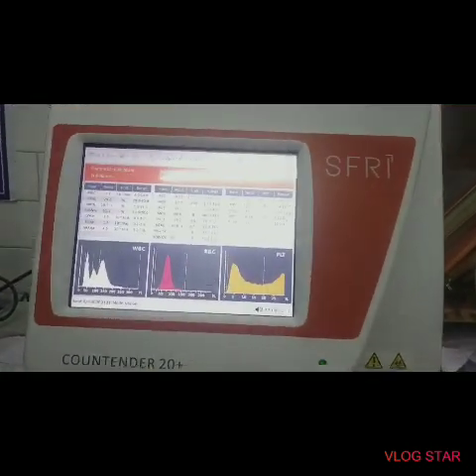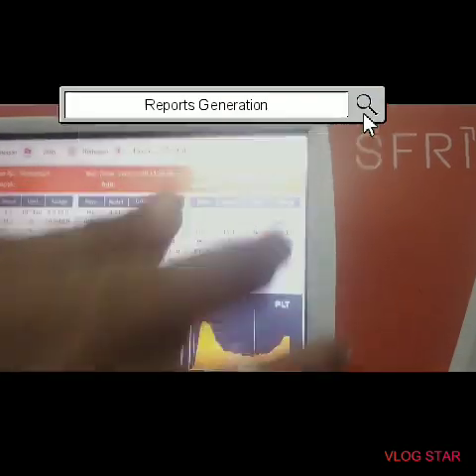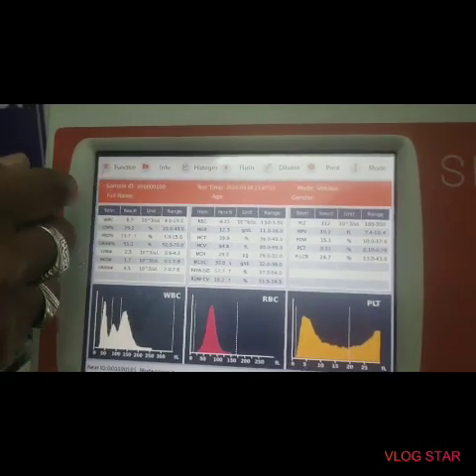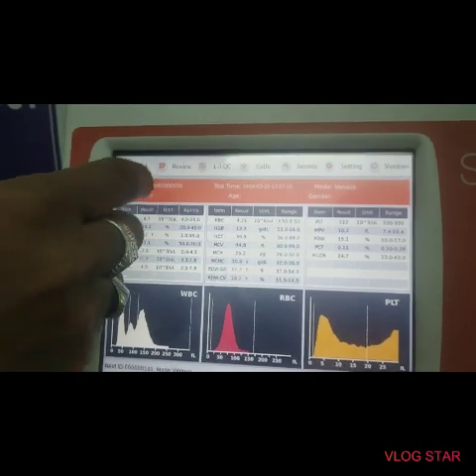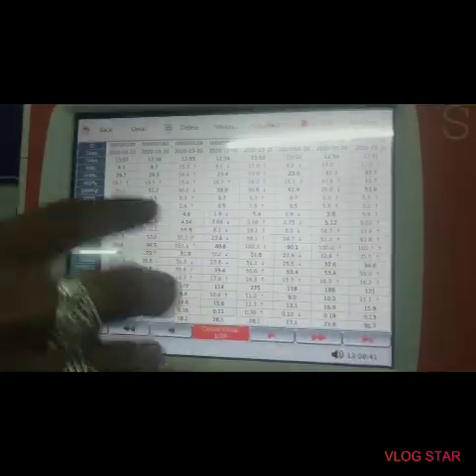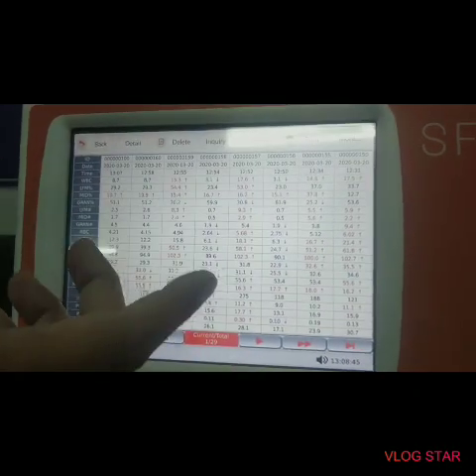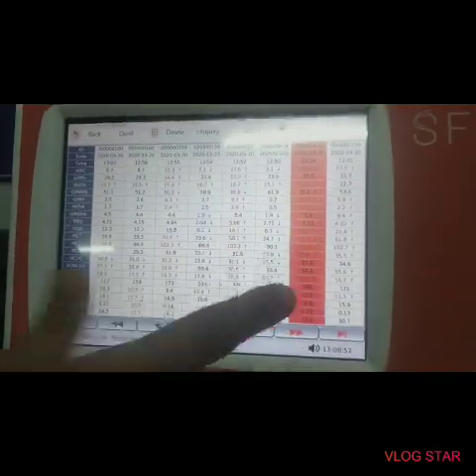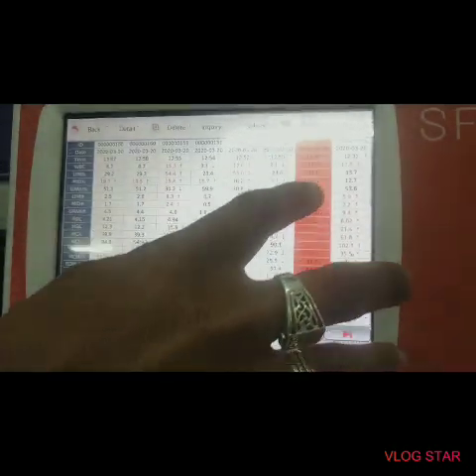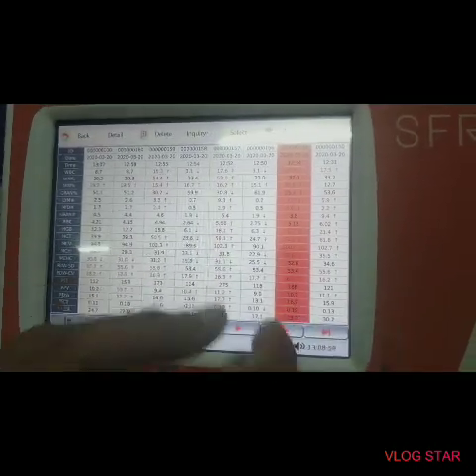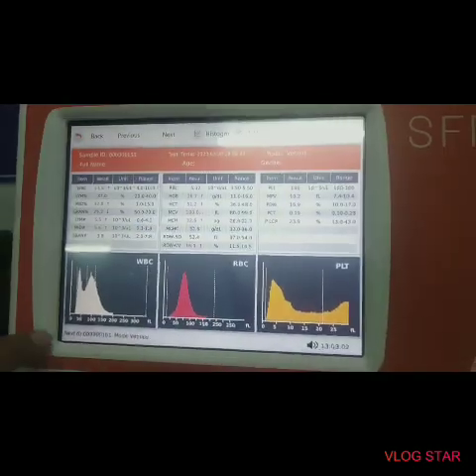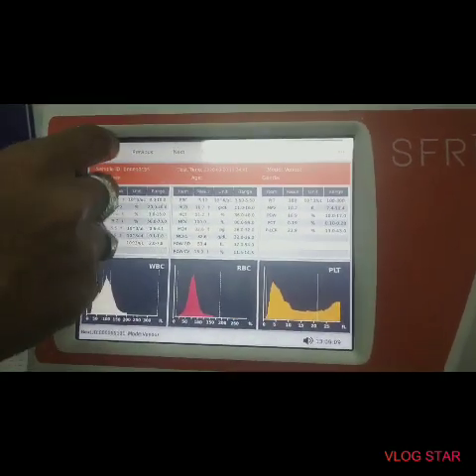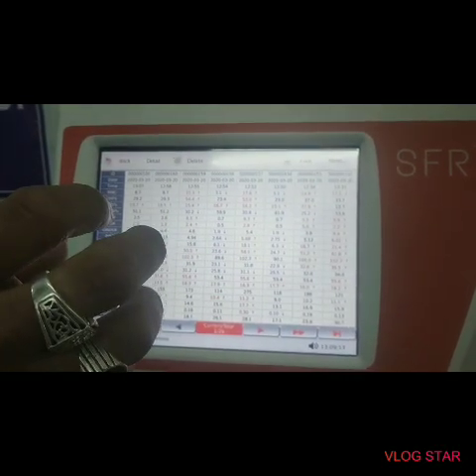I am going to press the print function, and then we will have auto print on. Then we will have samples from the previous video and we will see the function review. We will select our sample ID — we will see our ID-wise — and then we will select and see the enlarged view. We will see the data and the detail, then go to print.